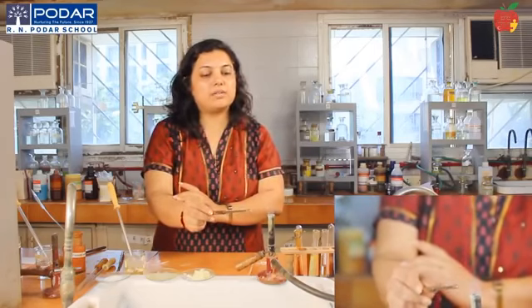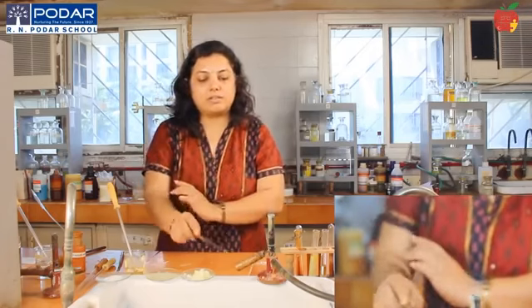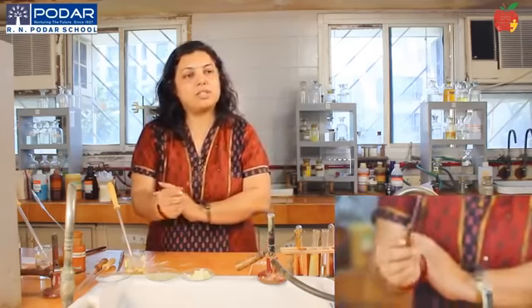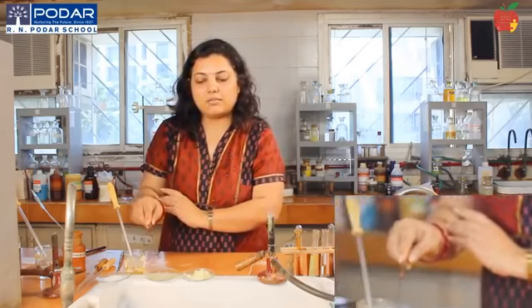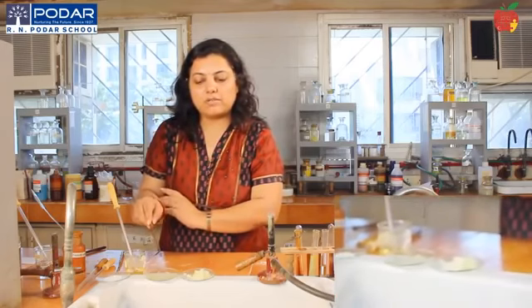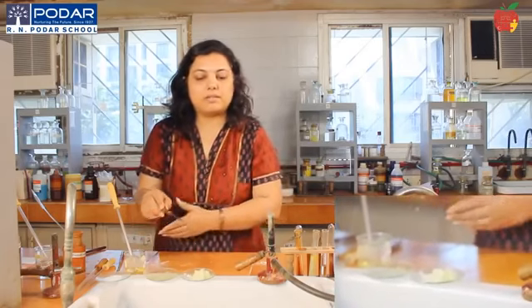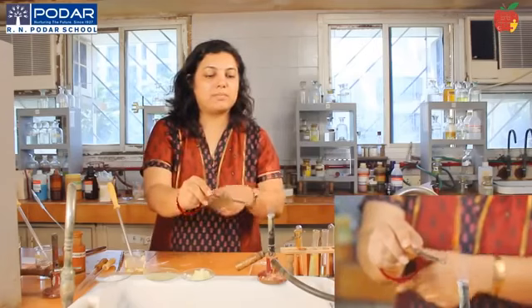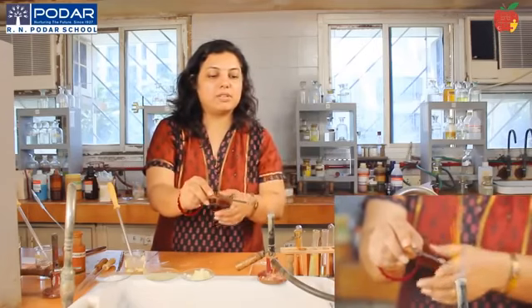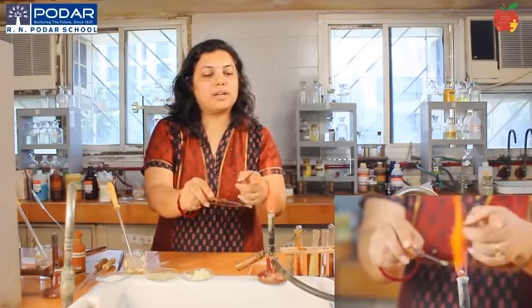Okay, now you see that the whole of the strontium has gone. Ideally I should wash it and treat it with acid, but just to show you again, I'll dip this in your calcium salt. Can you see some streaks of color coming out? So that is for your calcium. A color is imparted to the flame.